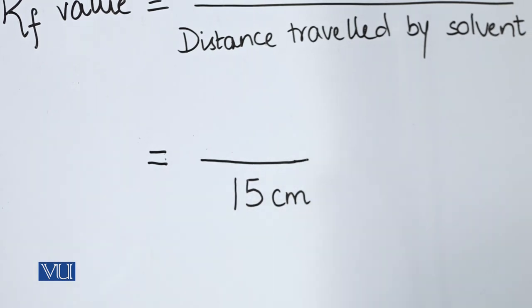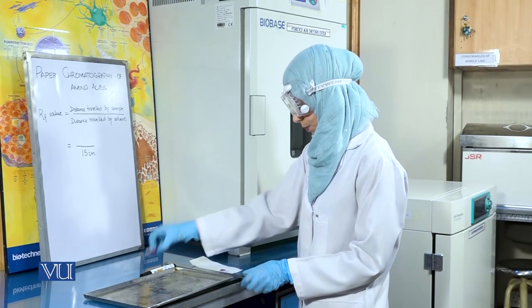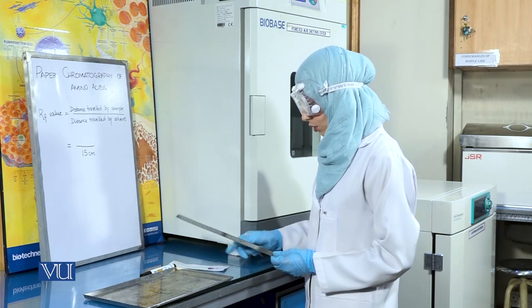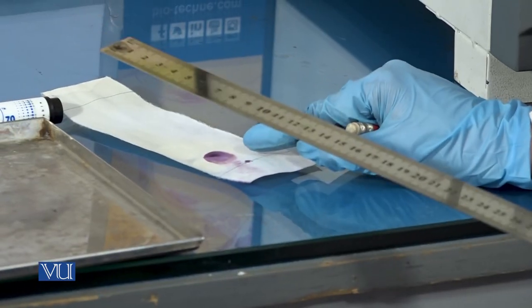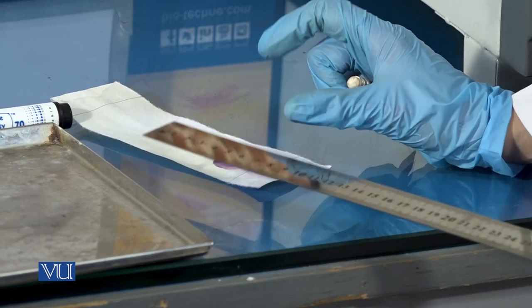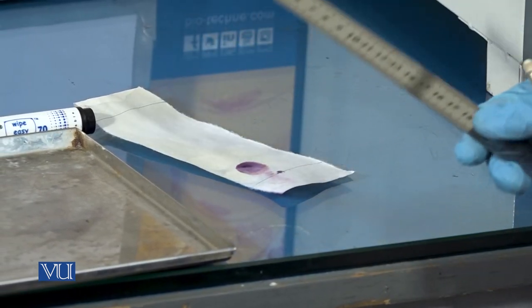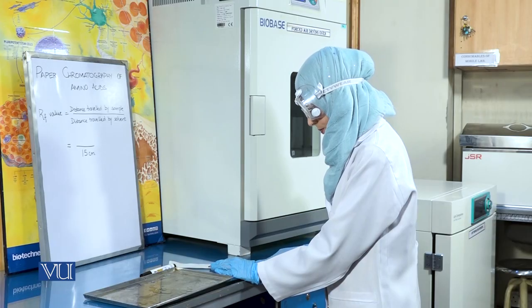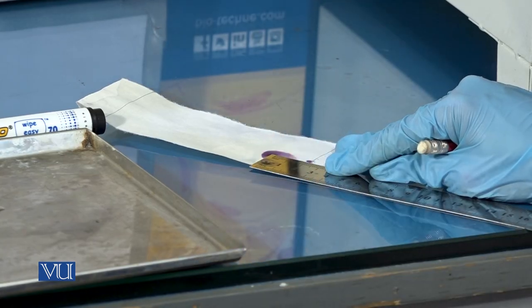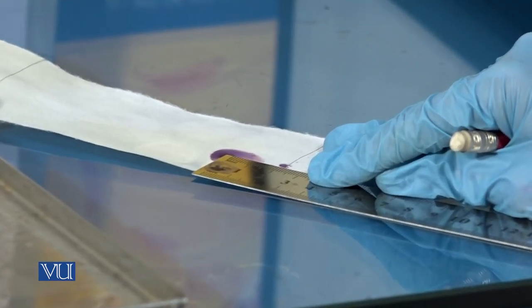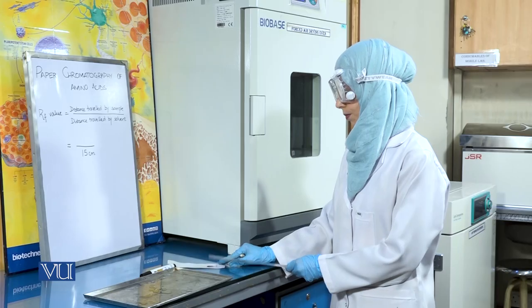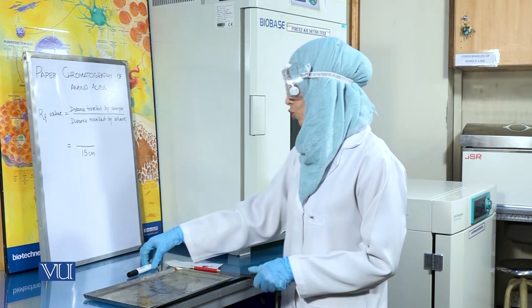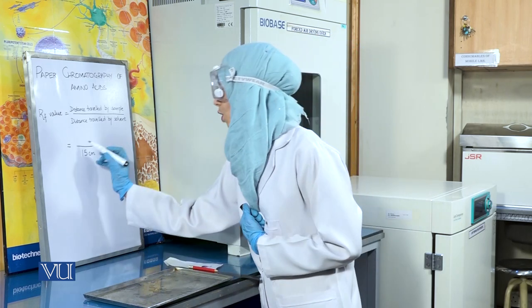This comes out to be 15 cm for our sample. We will then calculate the distance travelled by the spot or sample on the filter paper. We will measure the distance from the center of the spot. This comes out to be 2.1 cm for our sample.